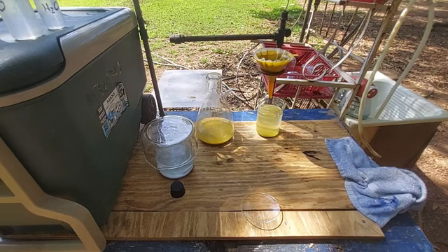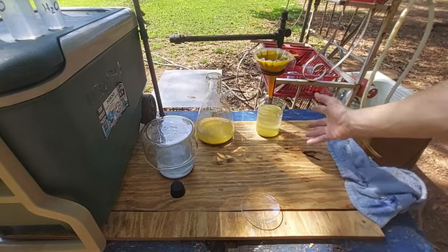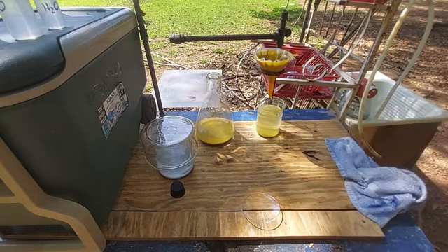Now, a couple people have asked me about wastewater. Well, the wastewater is pretty easy. You just discard it. The wastewater for this is very alkaline.